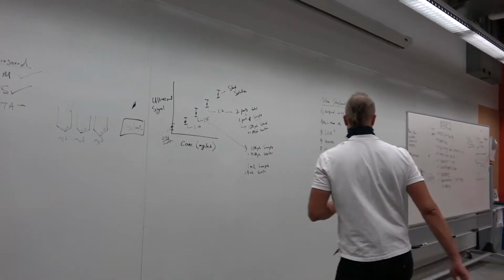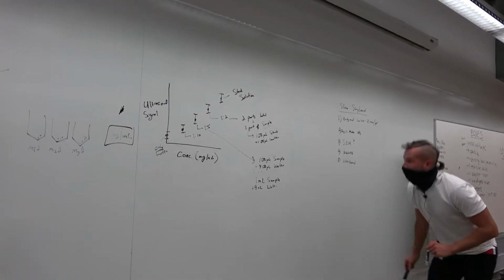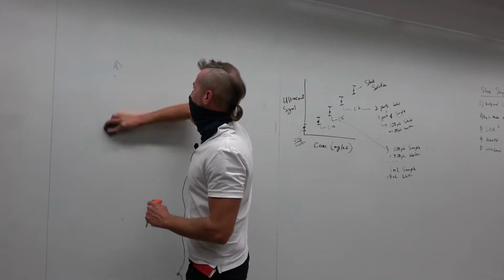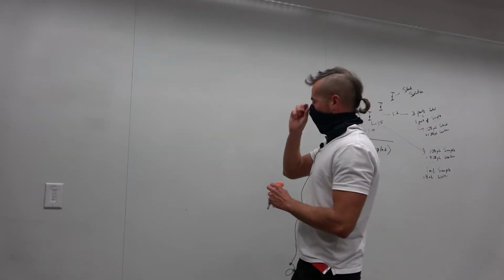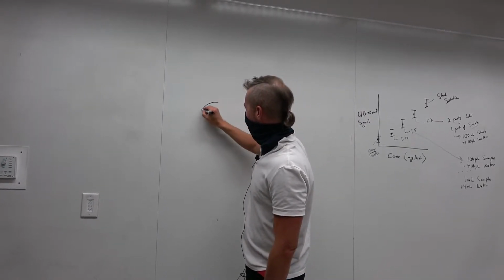Okay? So let's talk a little bit more about what that's going to look like. You're going to put this into what's known as a phantom.